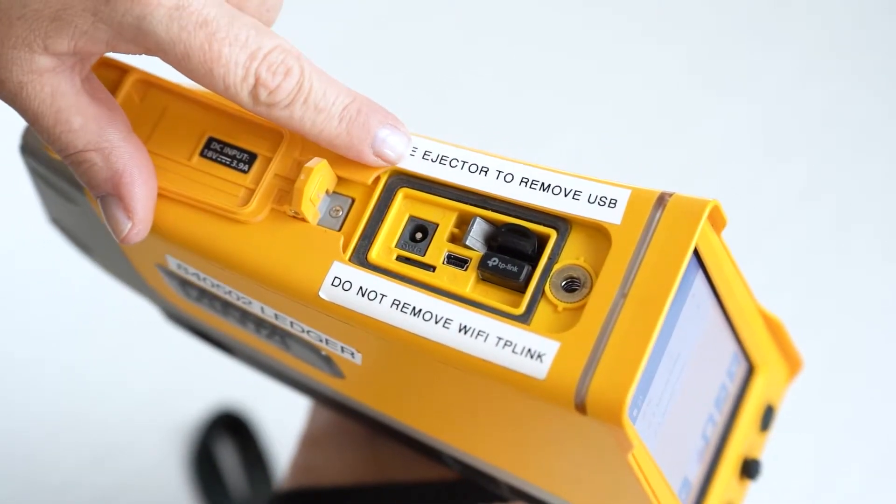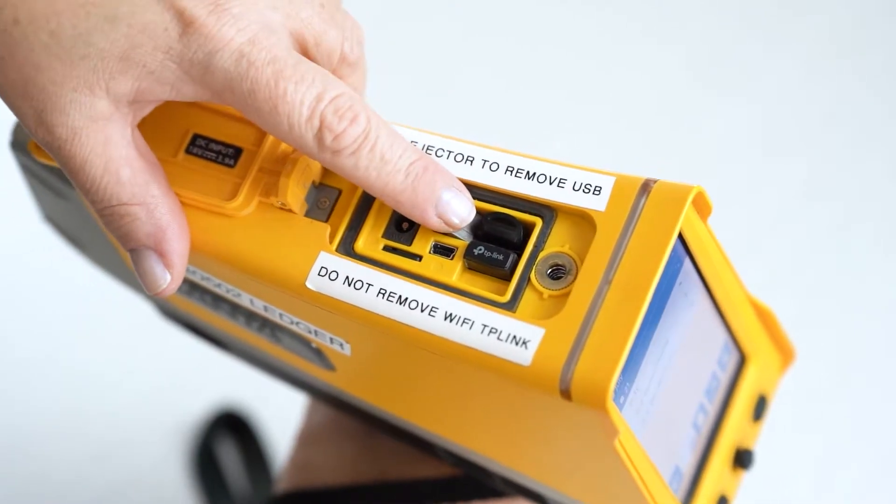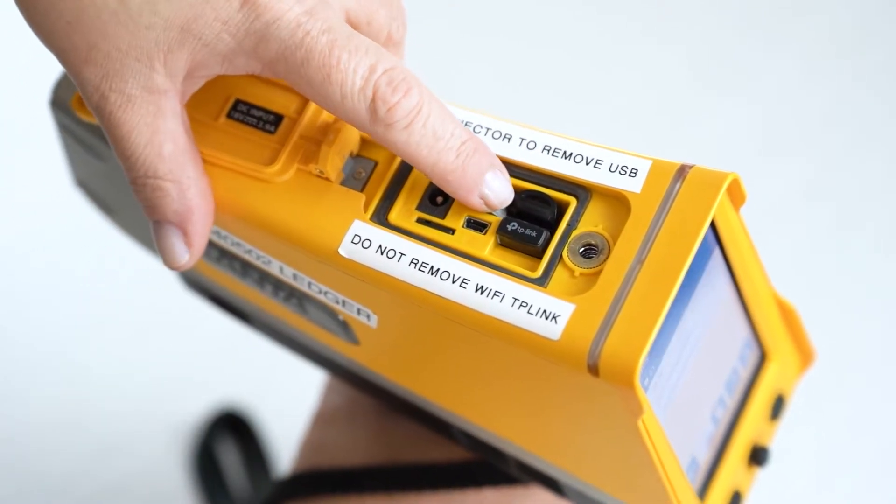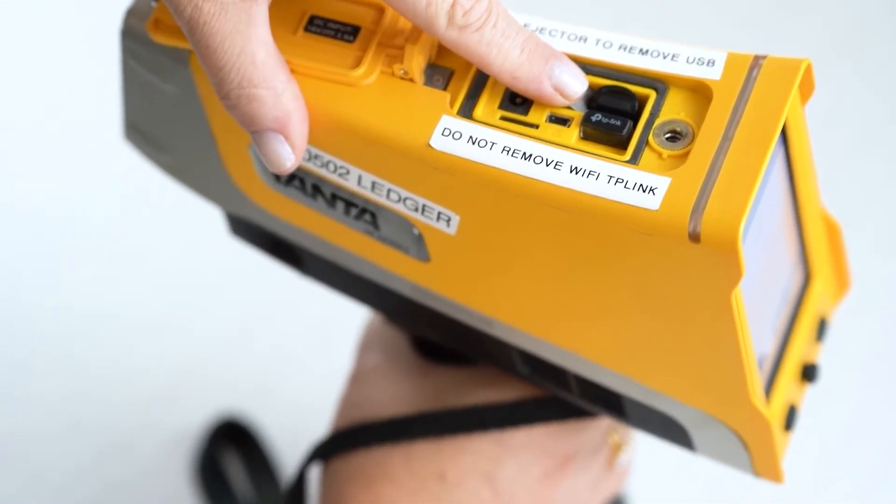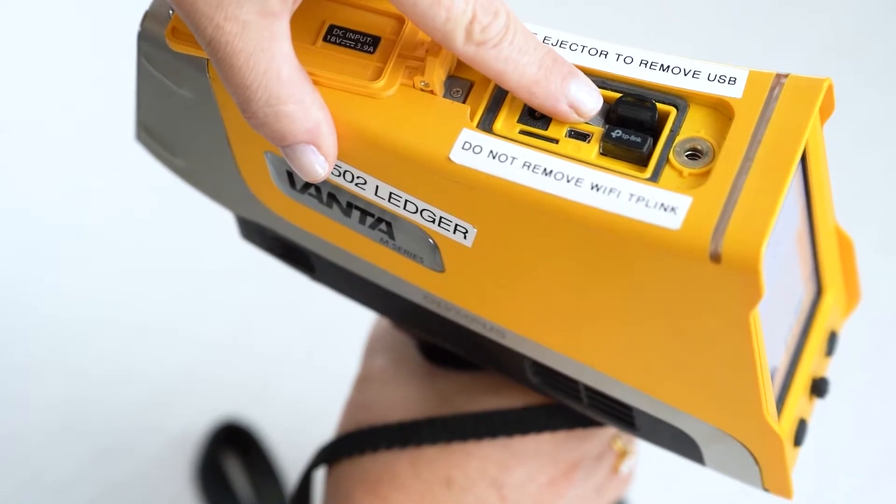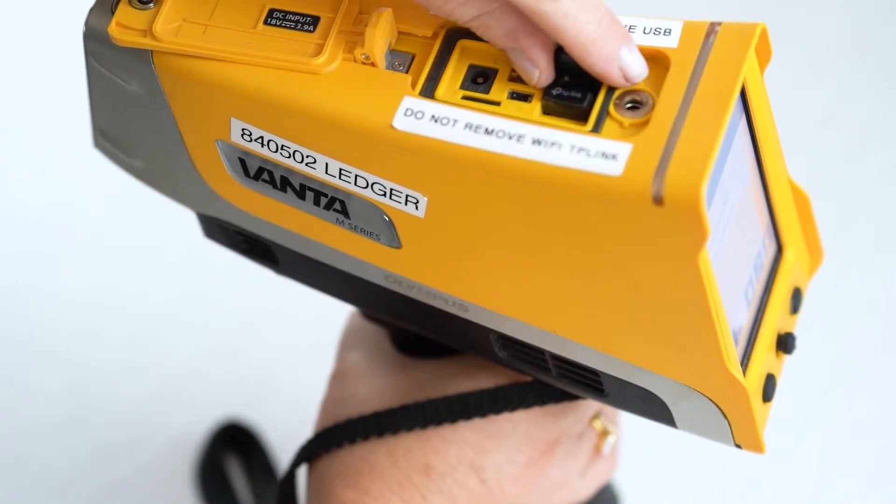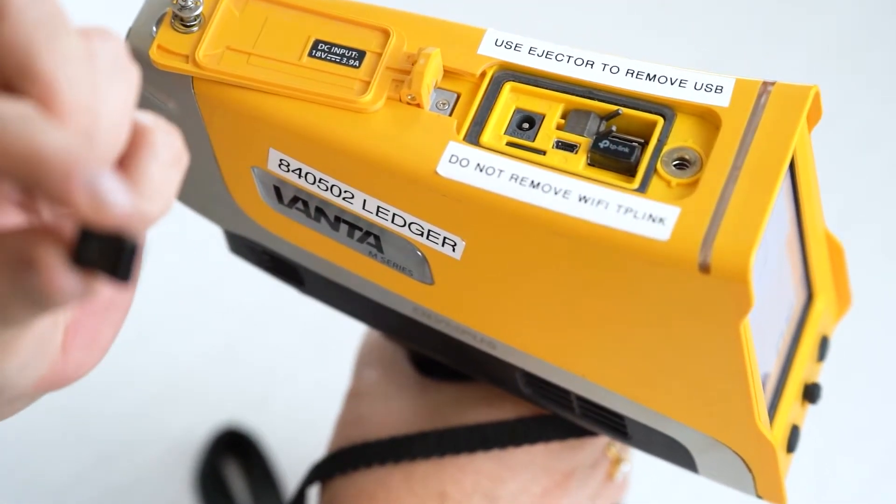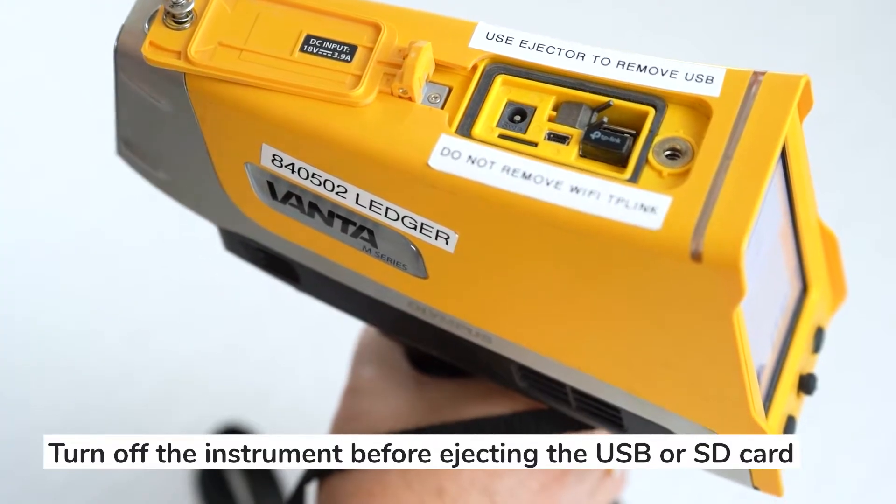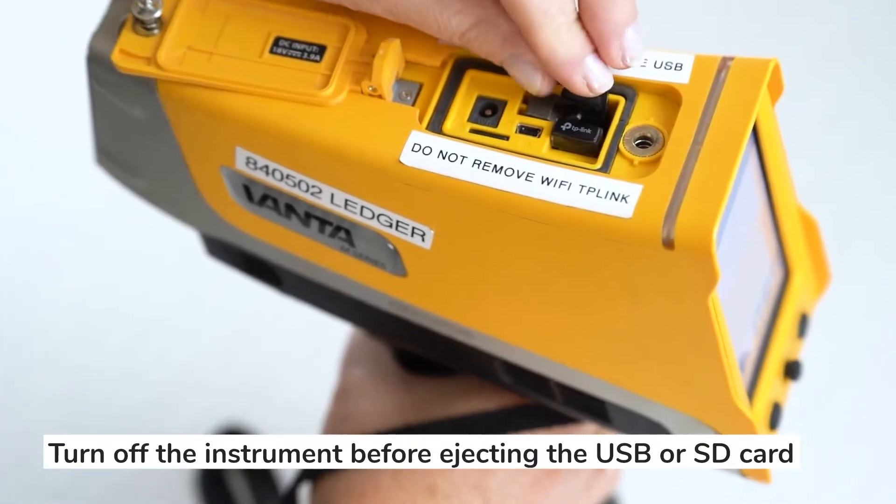You just push and it will come out. So we're just going to push on this to release the USB. Take it out and put it in your PC, and then we put it back in.